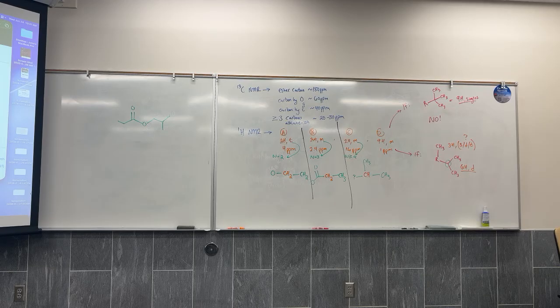Okay, I don't believe I gave you something with an alkyne, no methoxys. Ethyl butyrate is a good idea. That is something we should investigate. That looks really similar, but not the same. There's too many signals spread out around one. The signals are too clean. That 1H that I gave you guys is a lot cleaner than the 1H that we're seeing here. I'll bet that's the mistake. This is probably not a 1H. Okay, so we go back, return to the results, and we keep searching.